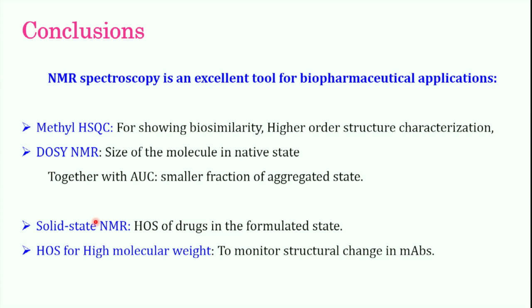Next, I moved to solid state NMR, and I showed that in fact we can do the higher order structural similarity of a drug in formulated state without perturbing anything, directly taking it from the pen. You can record the solid state NMR spectrum, and I also showed that we can even tackle the monoclonal antibody, which is high molecular weight, and in a qualitative as well as quantitative manner we can investigate the higher order structural analysis.